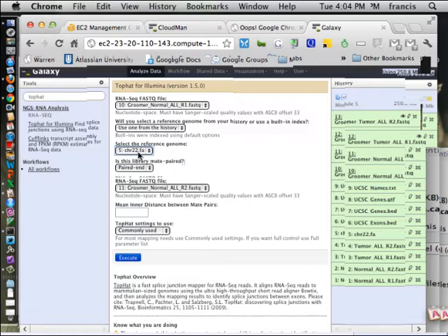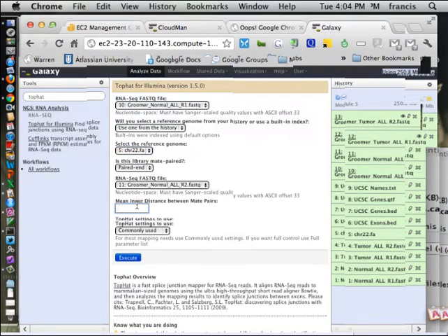You can cancel every step that is not okay, with a cross. You can delete them. Then you can select paired end as well, because you want to run it in paired end mode. And so you can select the normal, for example, read one, the normal read two, and then what is the mean inner distance between mate pairs? What was it? Remember that number? So you can execute that one and do exactly the same for the tumor.